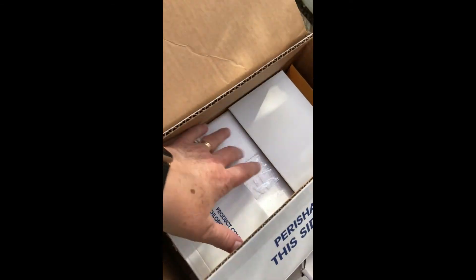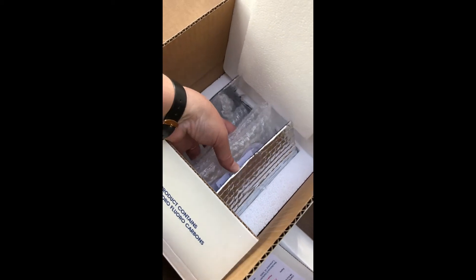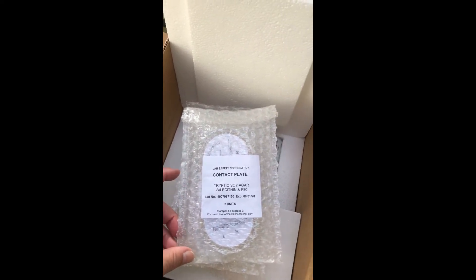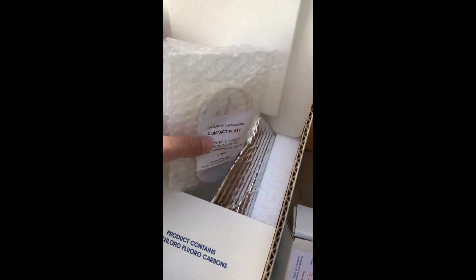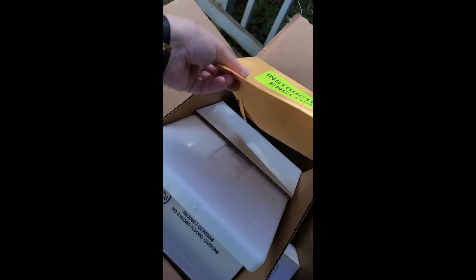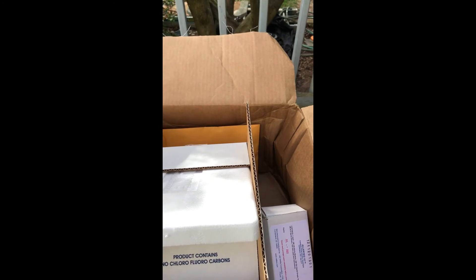The other box in the kit is your glove thumb fingerprint test kits. You'll receive three agar testing plates to do your glove thumb fingerprint test, and those are in styrofoam and need to be put in the refrigerator. The other two packages include the instructions — we recommend you read these first before you open anything — and the return package information. After you complete the test, you mail them back to Valtech and they'll run the analysis and give you your results.